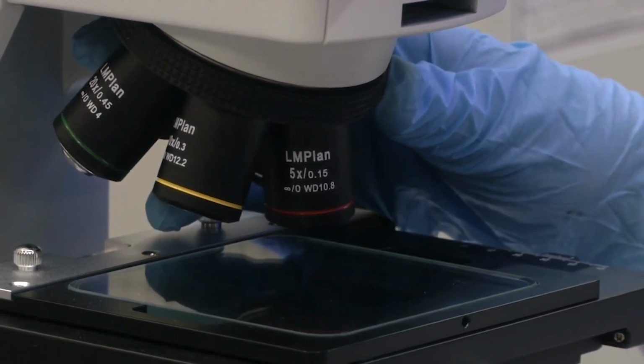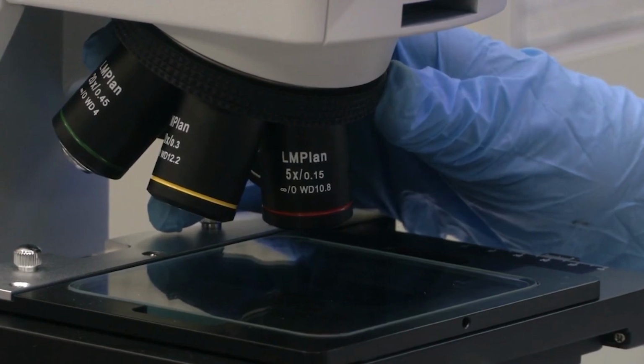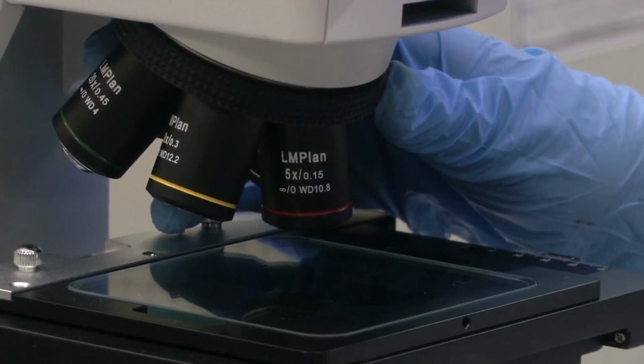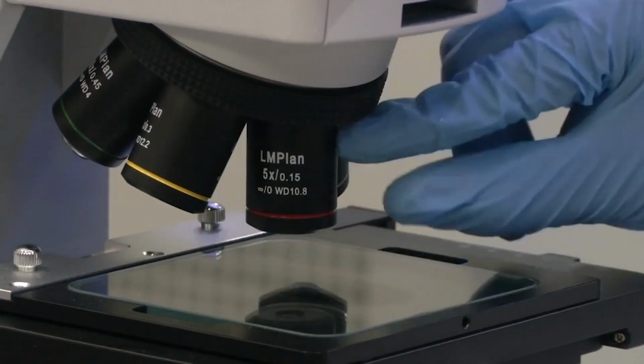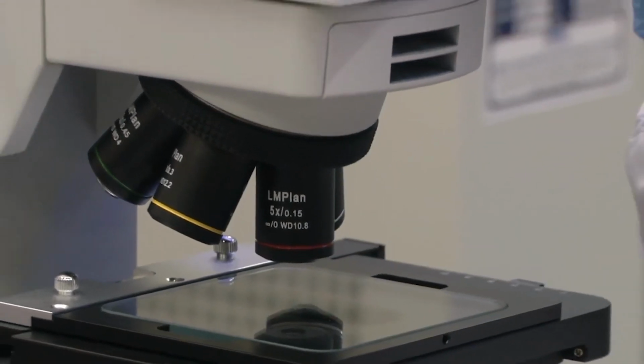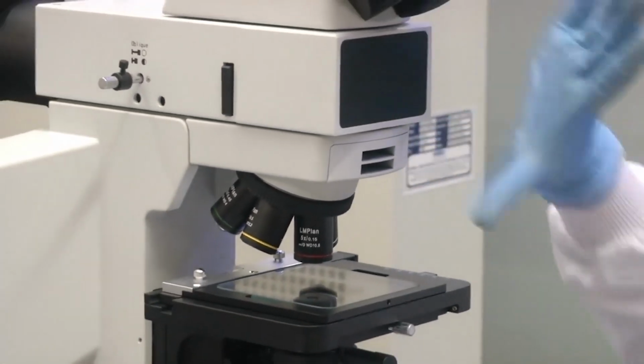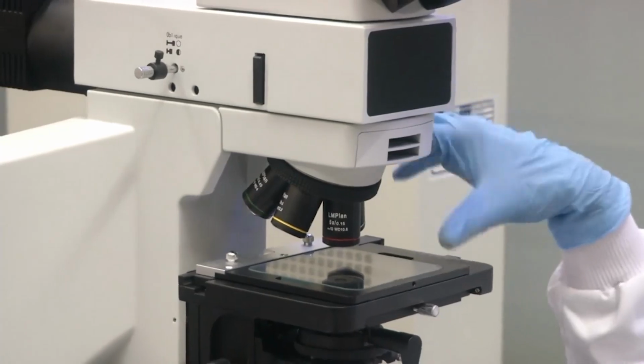This is usually the smallest objective lens that is provided on a microscope. It will either be 5x, 3x or 4x. So this 5x lens will provide 5x magnification. The eyepiece already has 10x magnification. So effectively 5 into 10, you will be seeing your sample at 50x magnification. That is the overall principle.